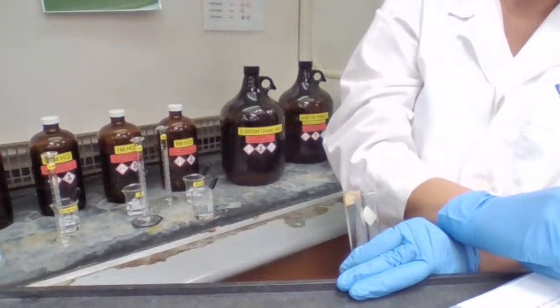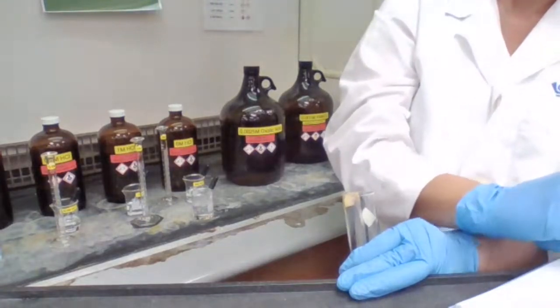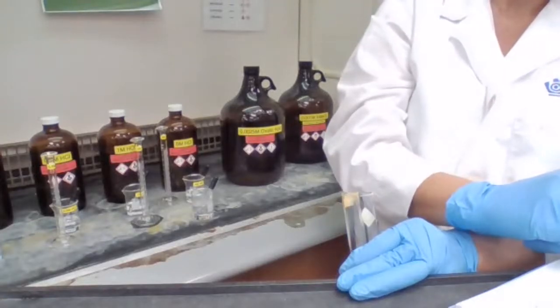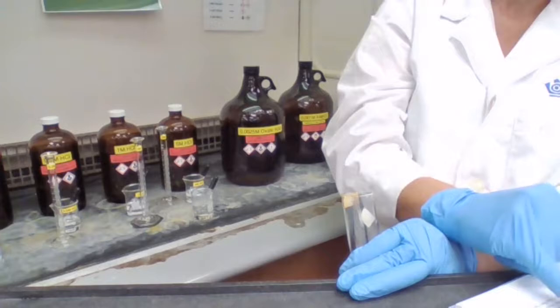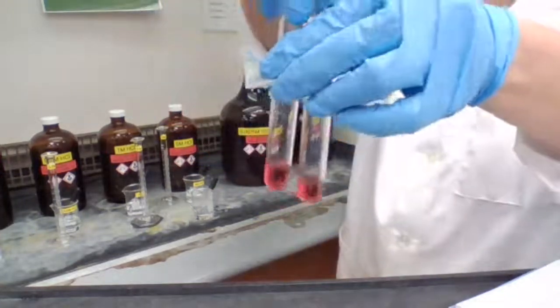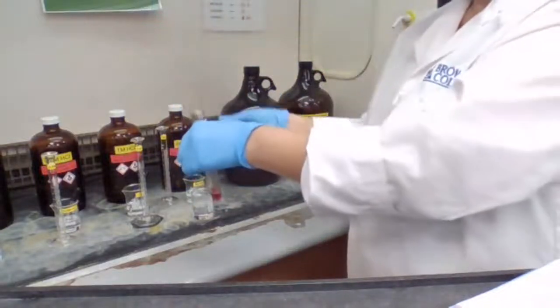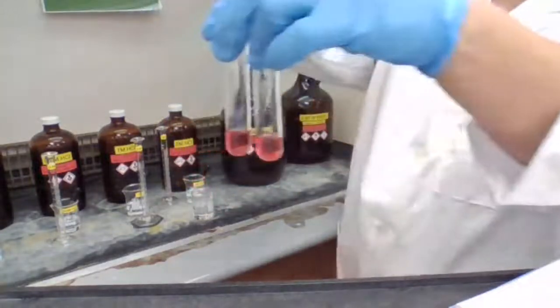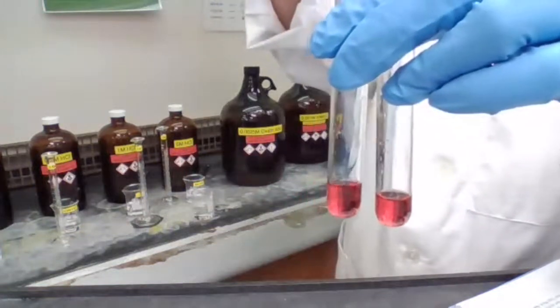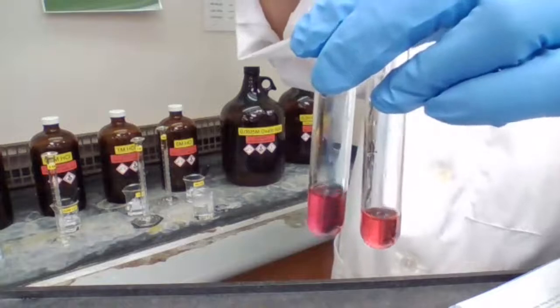Concentrated, dropwise to both tubes while stirring until we see some changes. This HCl is not just adding H+, it's also adding chloride ion.